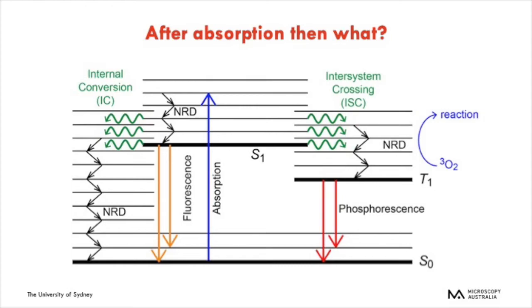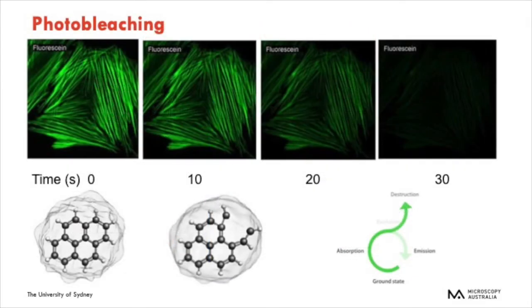The most common of these reactions you may encounter is the triplet-triplet oxygen reaction, also known as photobleaching. Here we have fluorescein-stained actin — at time zero, we excite it with 488nm light. At 10 seconds it's slightly dimmer, at 20 seconds slightly dimmer again, and at 30 seconds it has completely disappeared. What's happening is that the molecule vibrates so much it actually breaks a bond, meaning it is no longer available to fluoresce. This is one of the most common problems in fluorescence microscopy, and will be discussed later in sample preparation and in imaging.